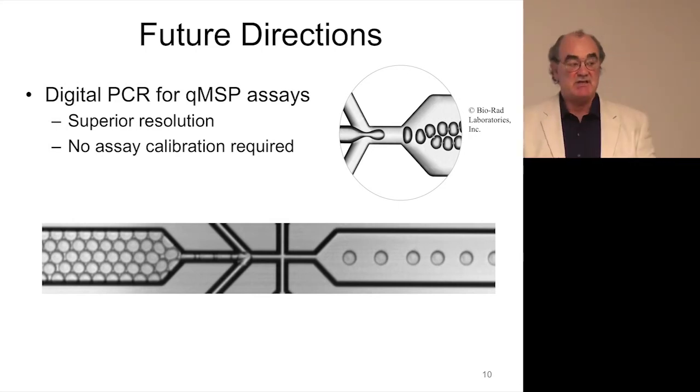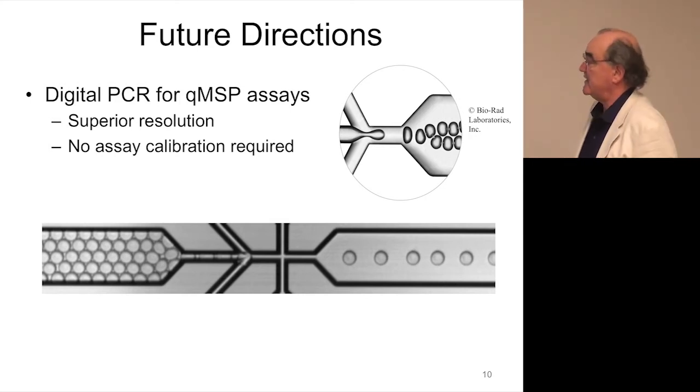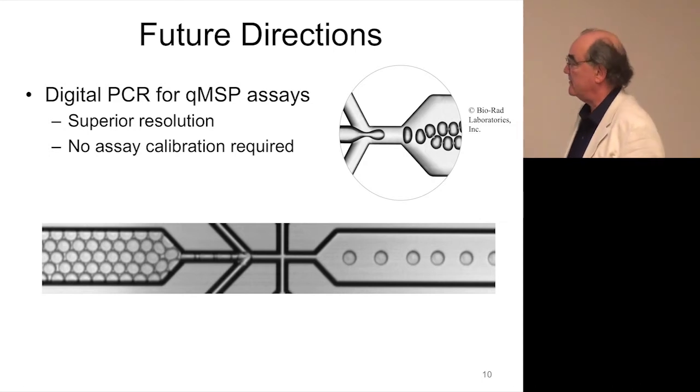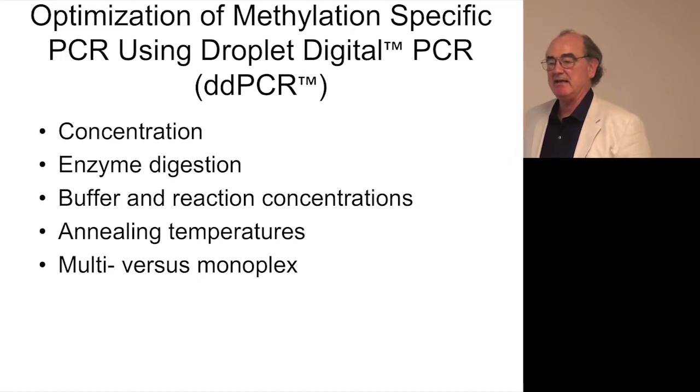And that is another reason you get into trouble with using quantitative PCR, because only one strand is being amplified. So you're lagging a CT right off the bat when you try to do a standard curve. So enough of that. I'll just show you some data, and then I'll get to, I think, an important conclusion about this.